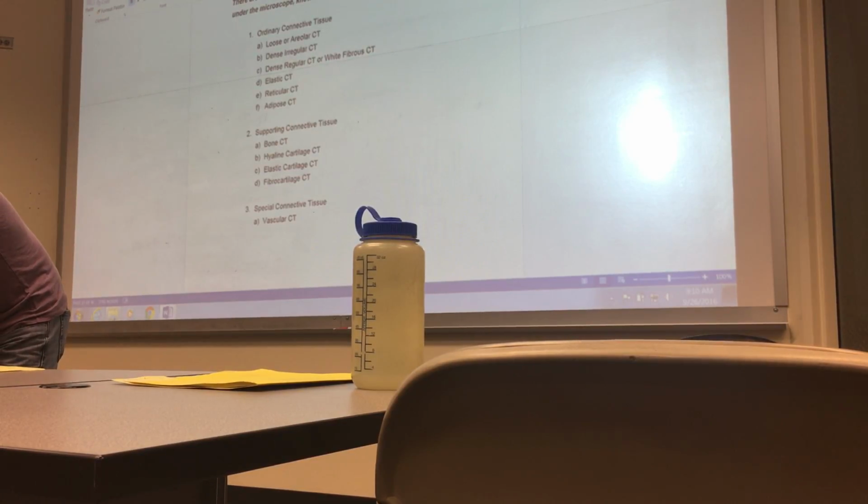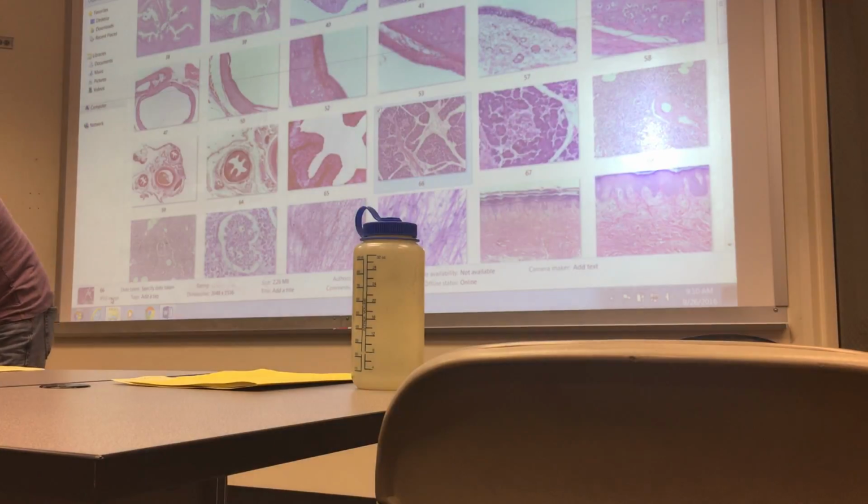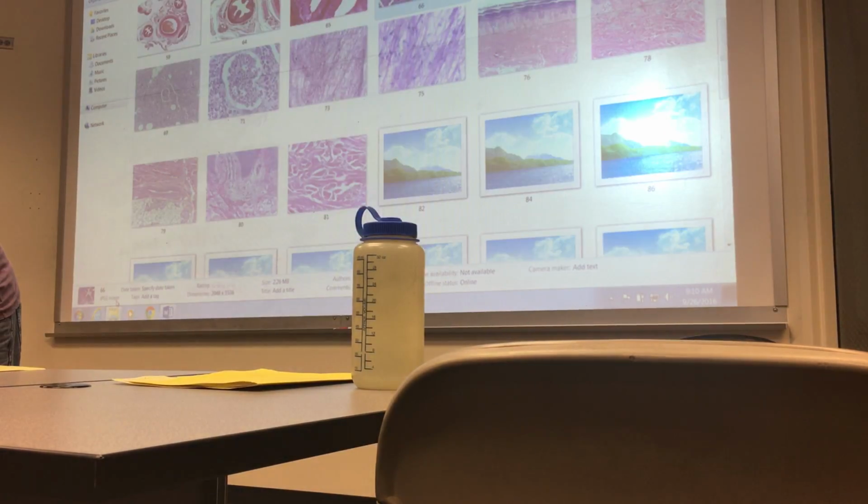I think the connective tissues are easier to recognize. You may not, I don't know. But I think they're easier to recognize just because, with one or two exceptions, they all look different from each other. I just don't think it's as easy to confuse any two of them. They're also very fast to go through. We don't really have to stop and draw on the board. They're pretty cut and dry to go through, and of course you've got it right there in front of you.